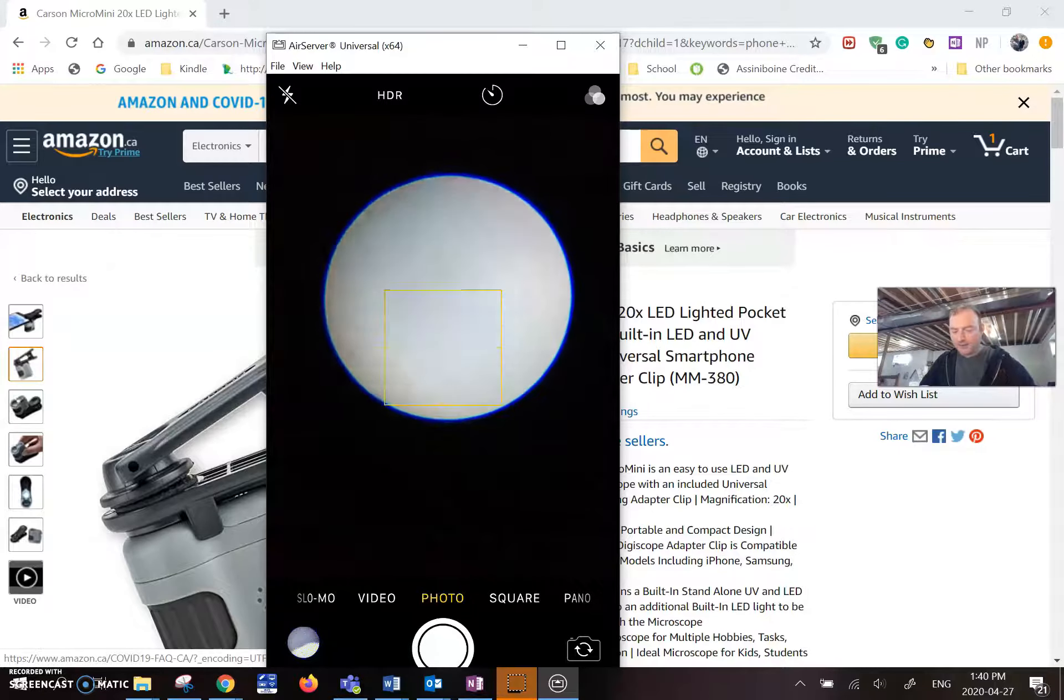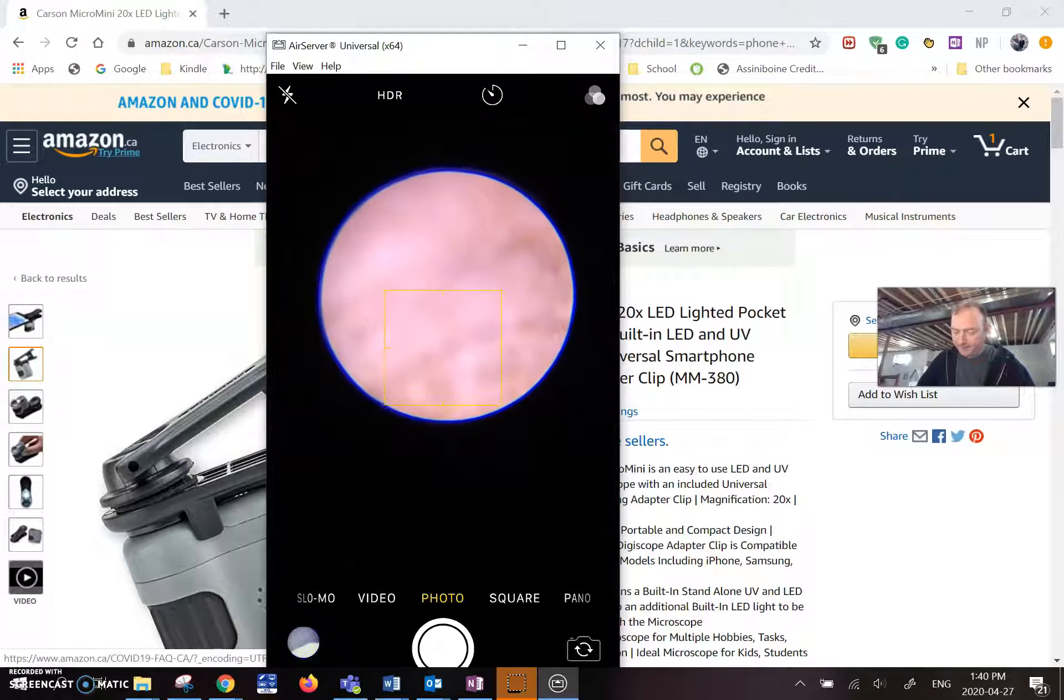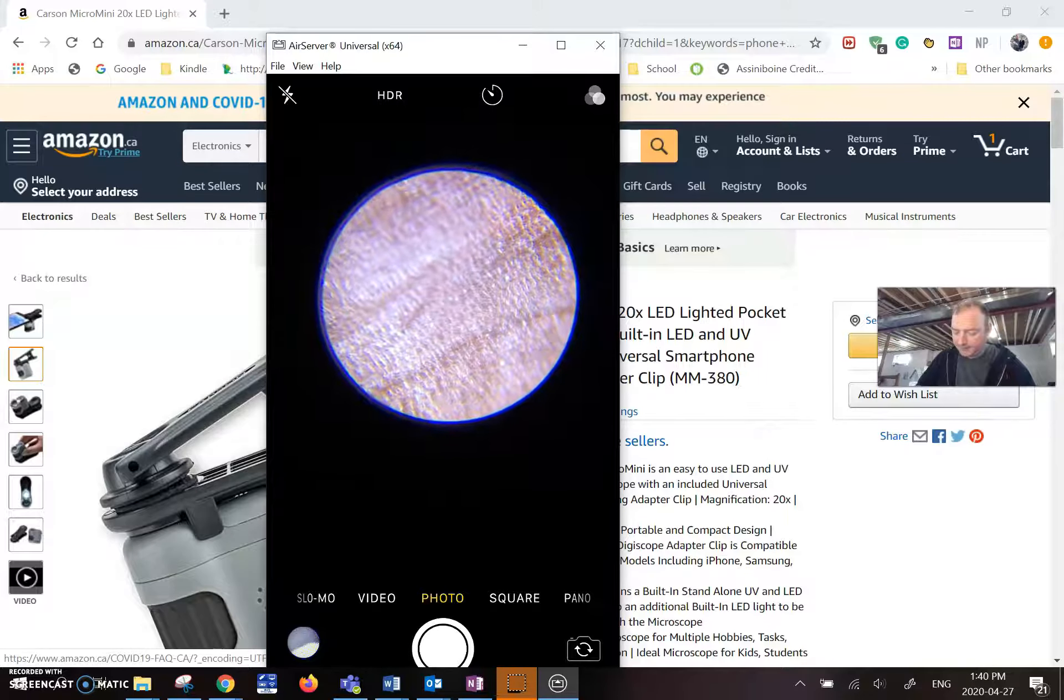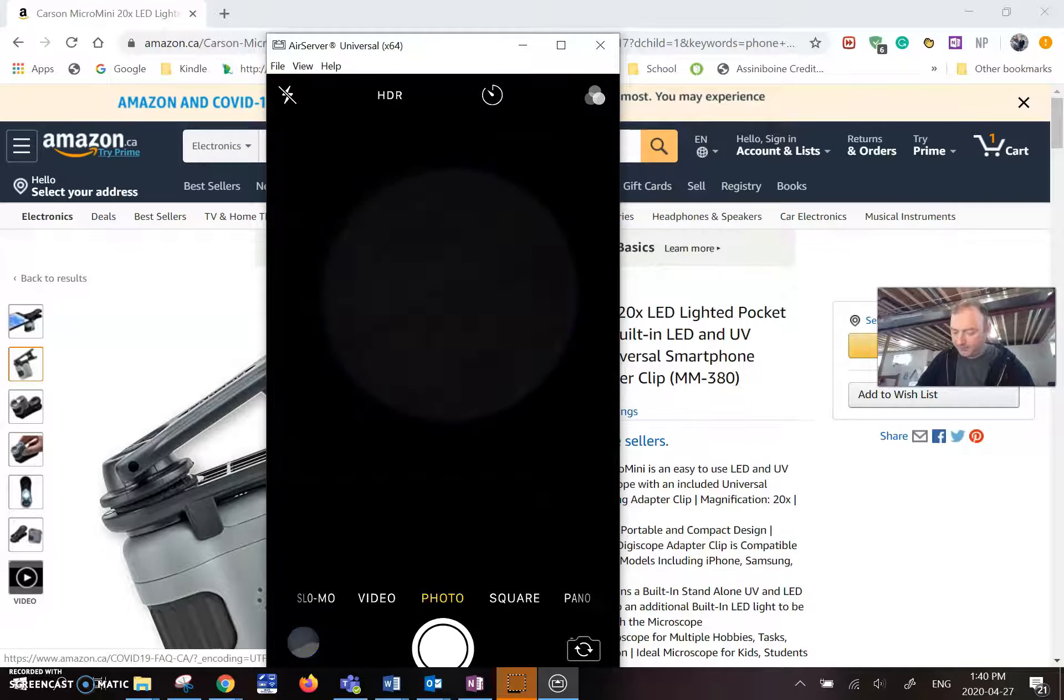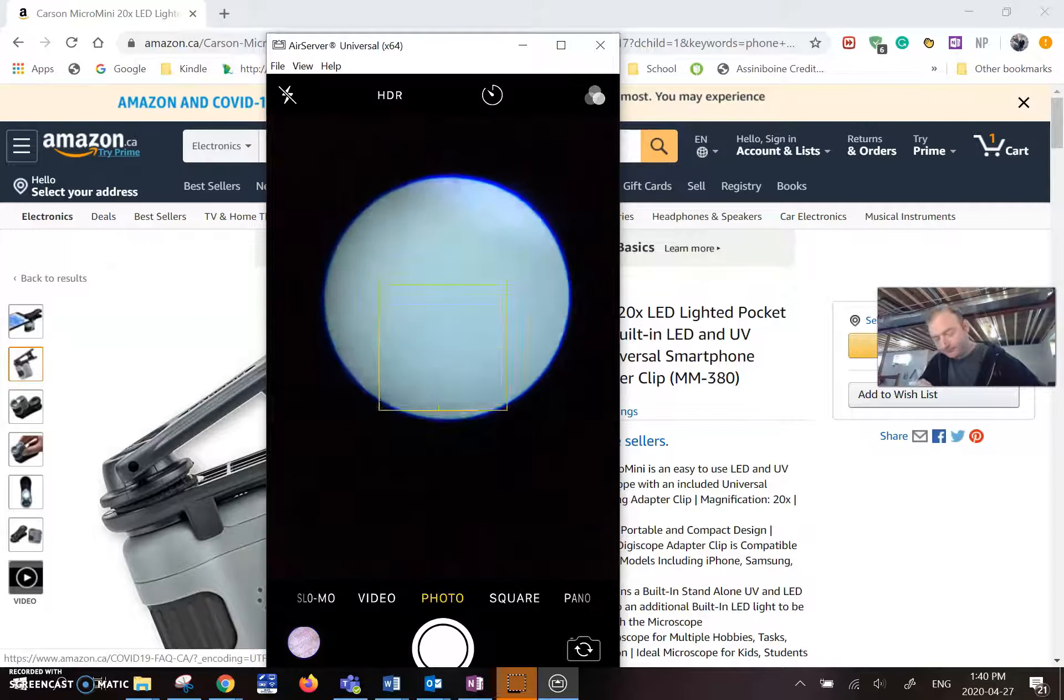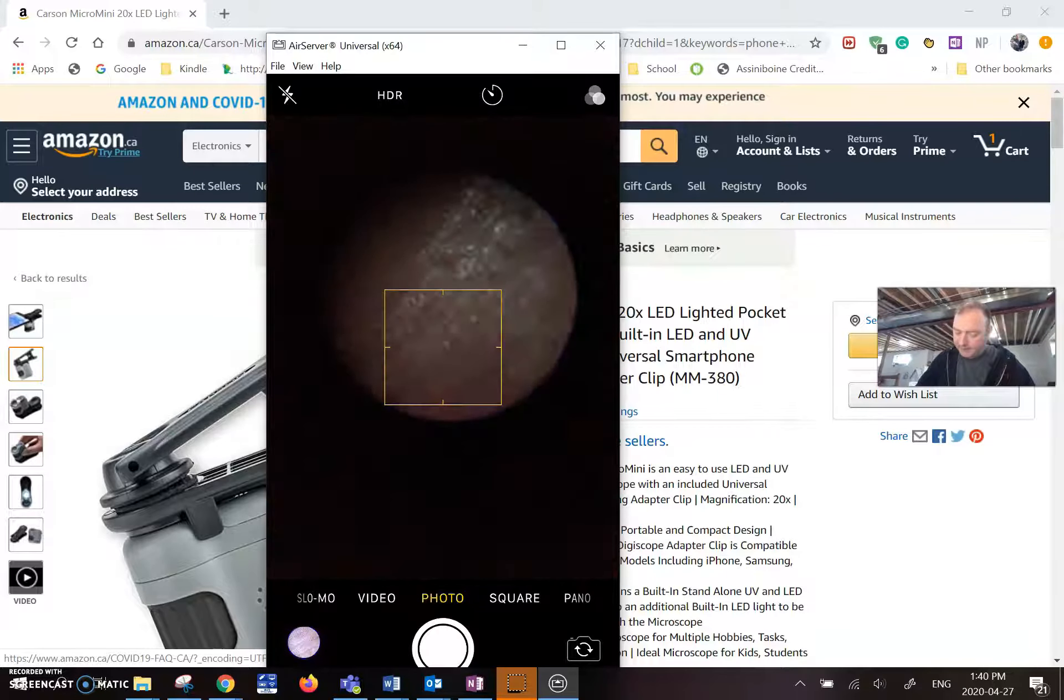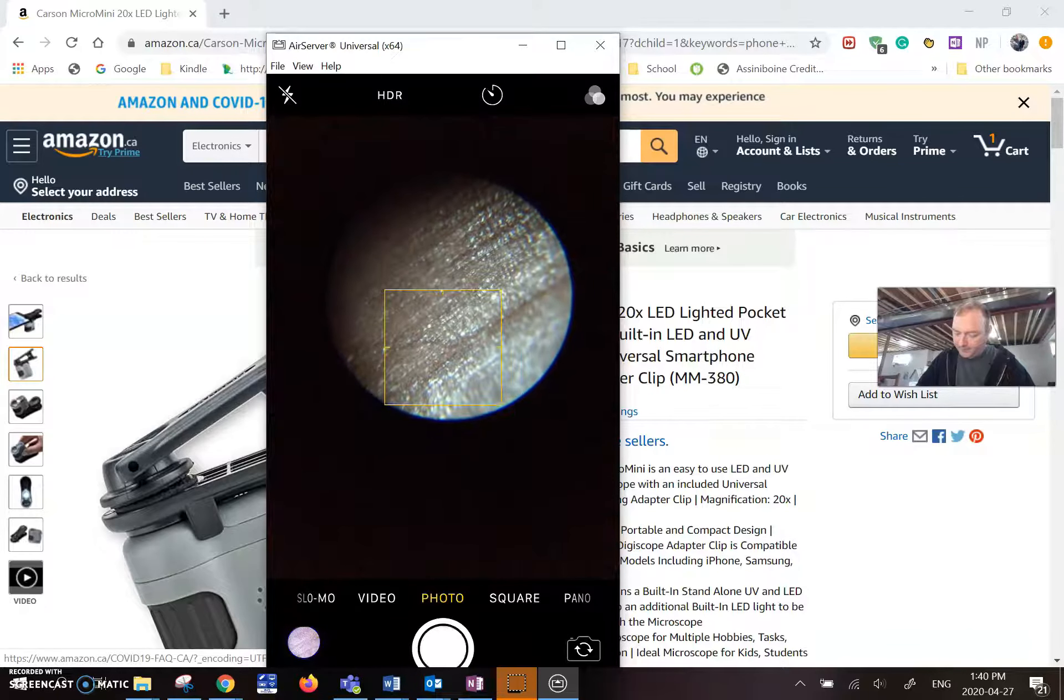I'm going to get this piece of onion skin here. See if I can get it flat enough to get a nice bead on the way it looks. This I might have to focus a little bit. And you can look at the individual, and you can see it. This isn't stained at all. If it was stained, we might be able to see individual cells a little better. I'm going to try the blue light with it. Maybe that'll be even more handy. Ooh, that's nice. Okay.